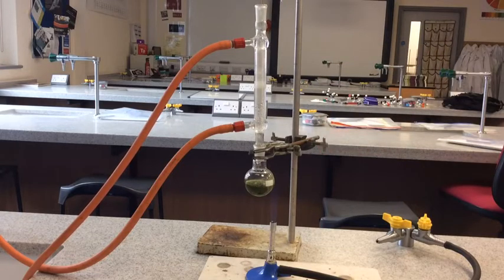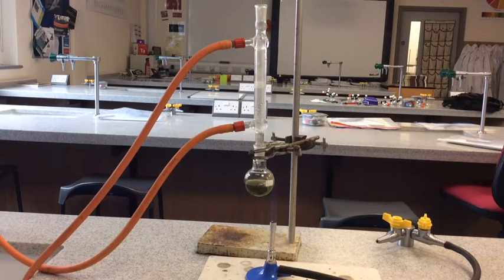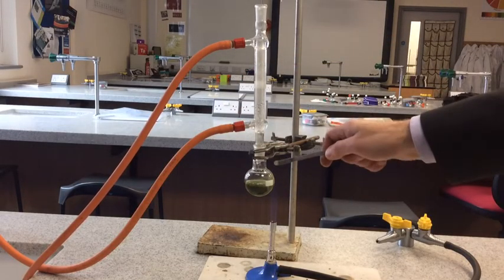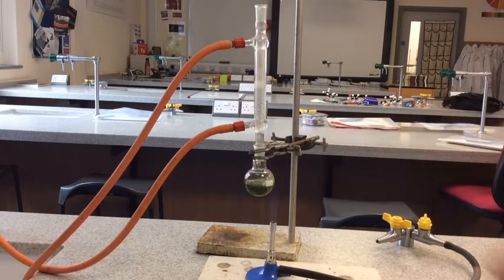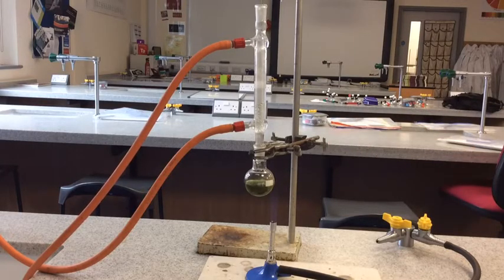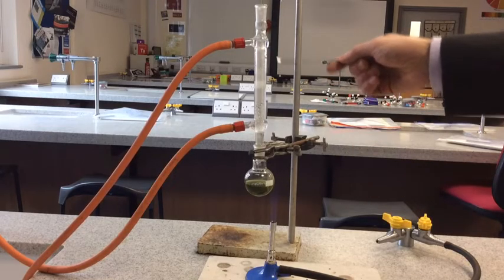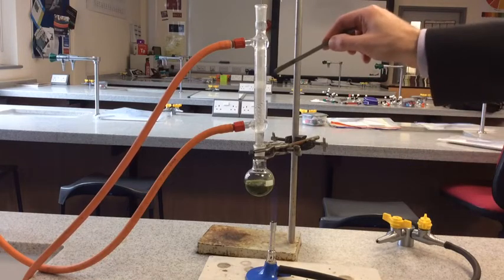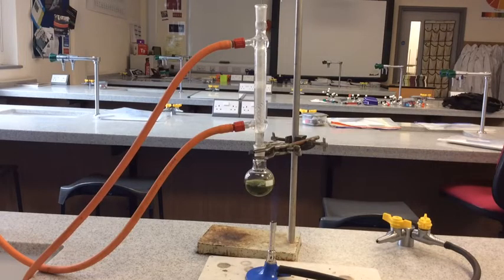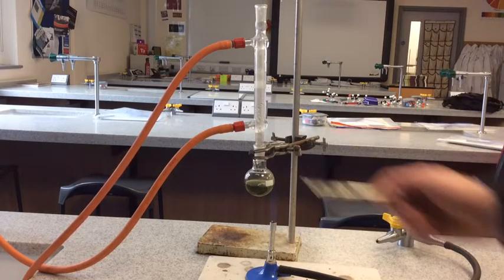Because the condenser is constantly surrounded by cold water - remember the cold water comes in at the bottom and out through the top - if you watch closely, roughly here, hopefully you'll be able to see drops of liquid running back down into this flask. What's happening is, as the aldehyde is produced it evaporates, but because this cold water is cooling it back down into a liquid, it condenses and falls back into the flask where there was more oxidizing agent, and so the second oxidation takes place.